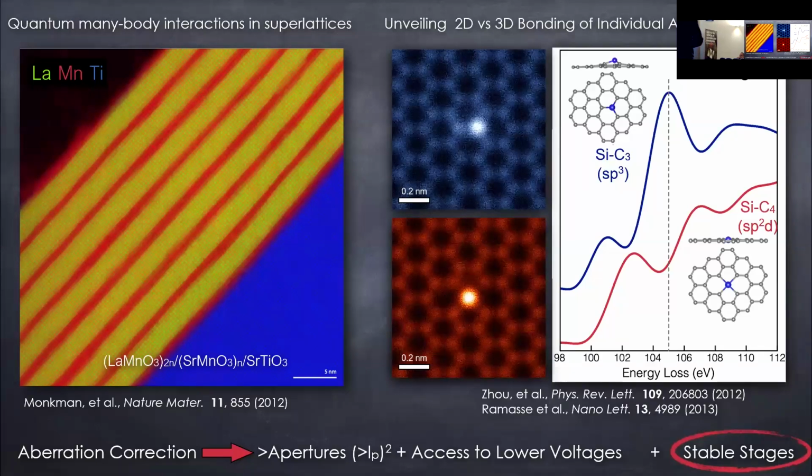Now, the other thing that is important, and it has not been mentioned explicitly, is the scattering cross sections. For an ADF image, for the pixels that you see in here, this is the ADF image, this is EELS. For every single pixel on that, we have a spectrum of EELS, right? These images are usually acquired at about 16 microseconds per pixel. The electrons go from left to right, top to bottom, and depending upon the size of the image in pixels, it takes a few seconds.